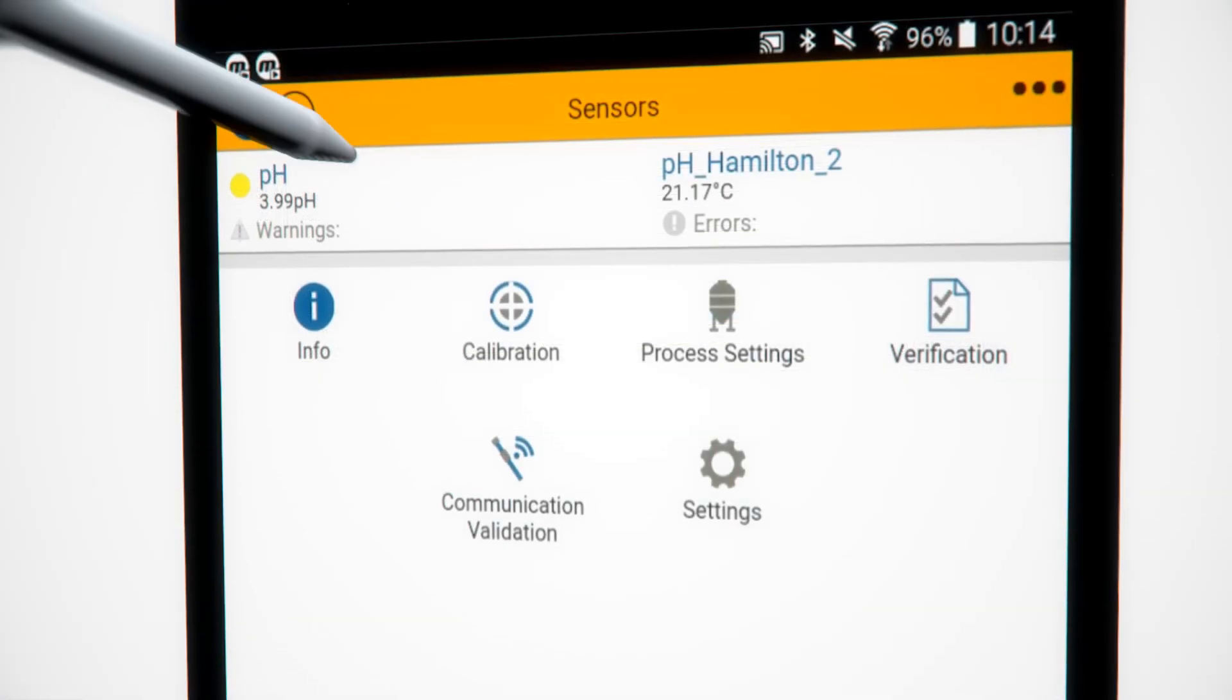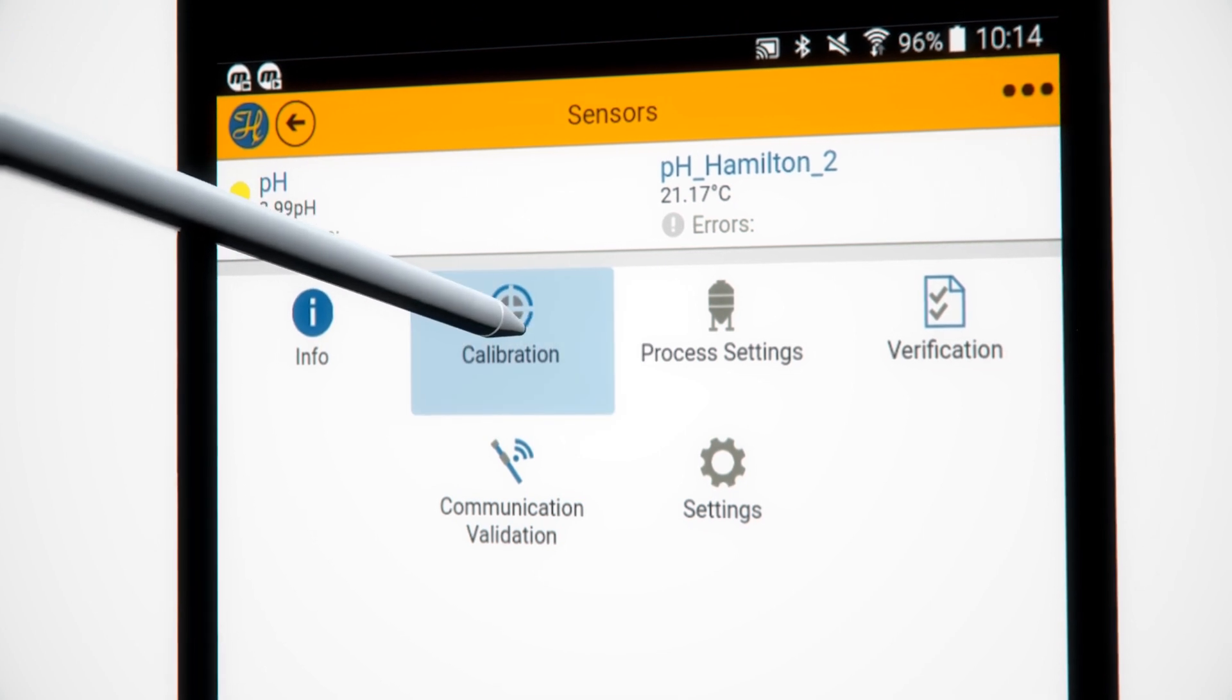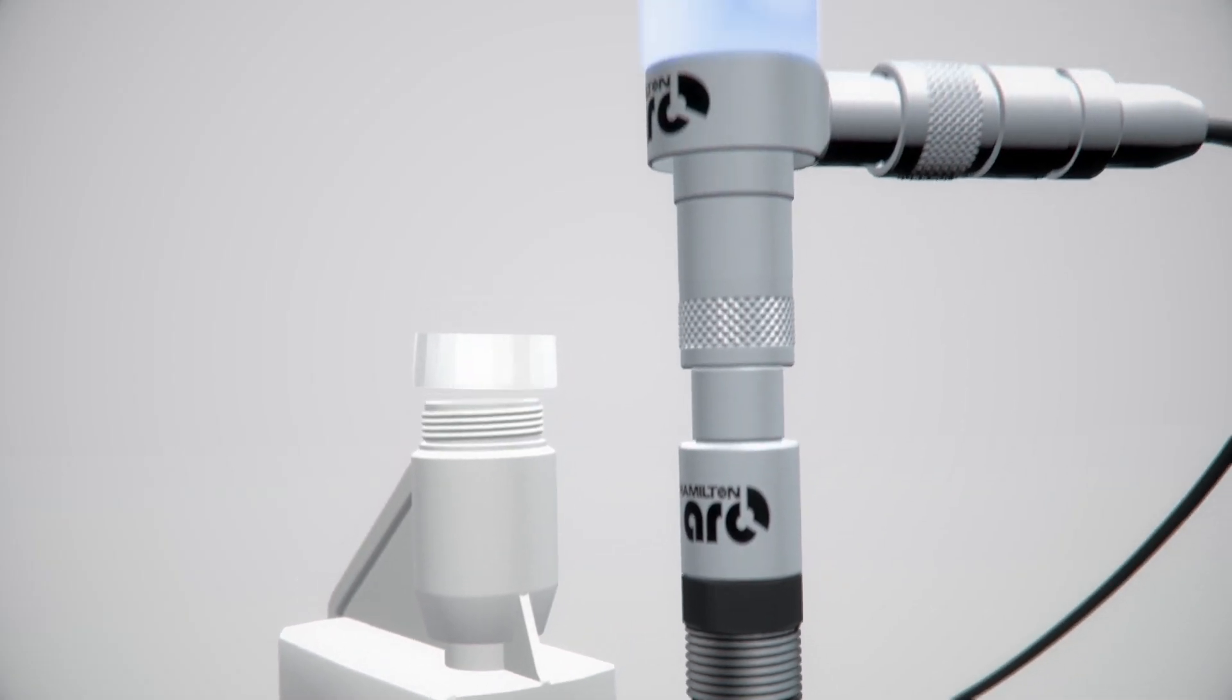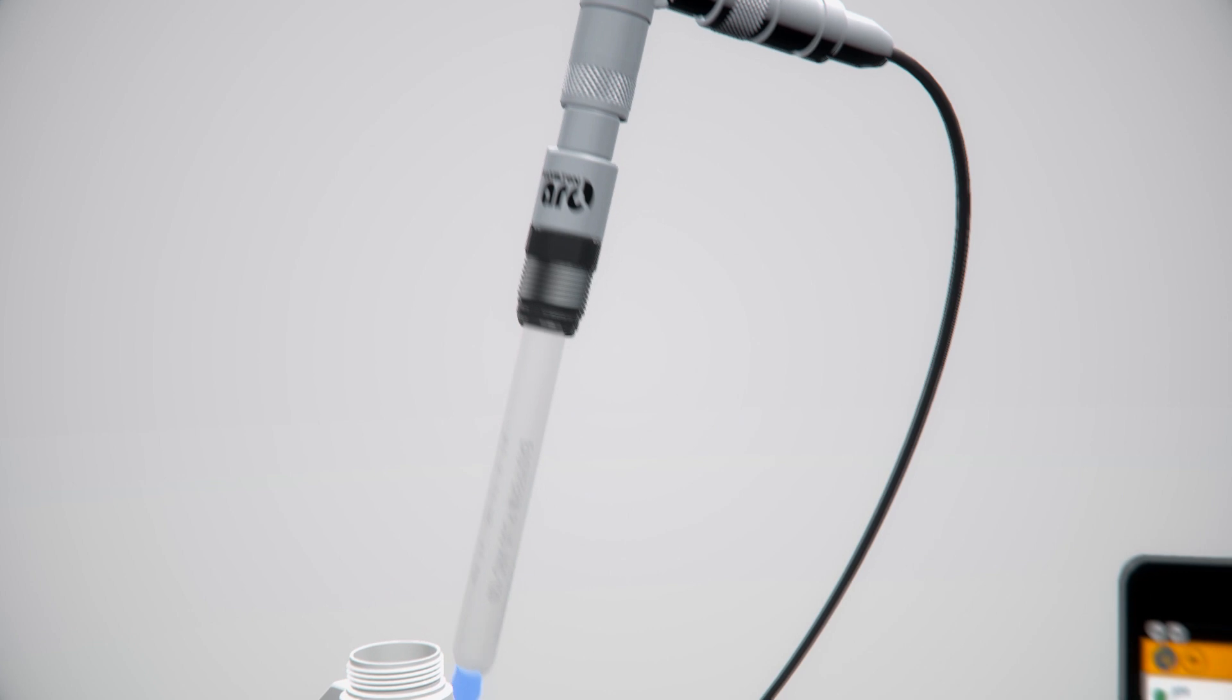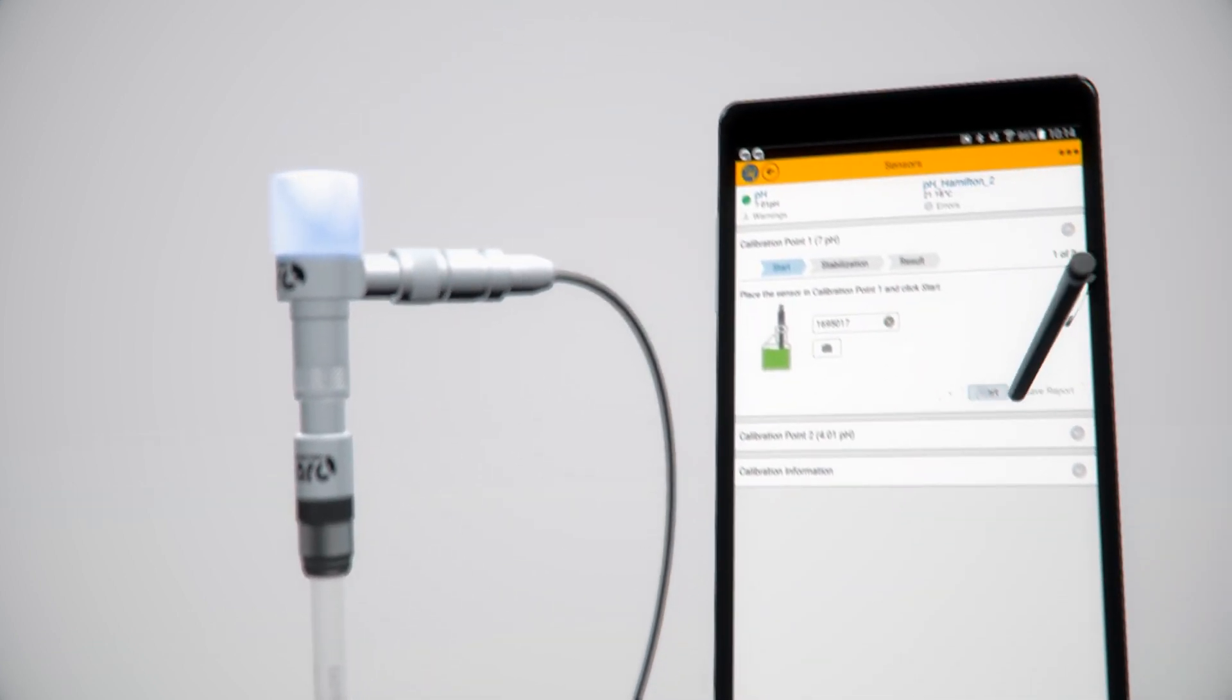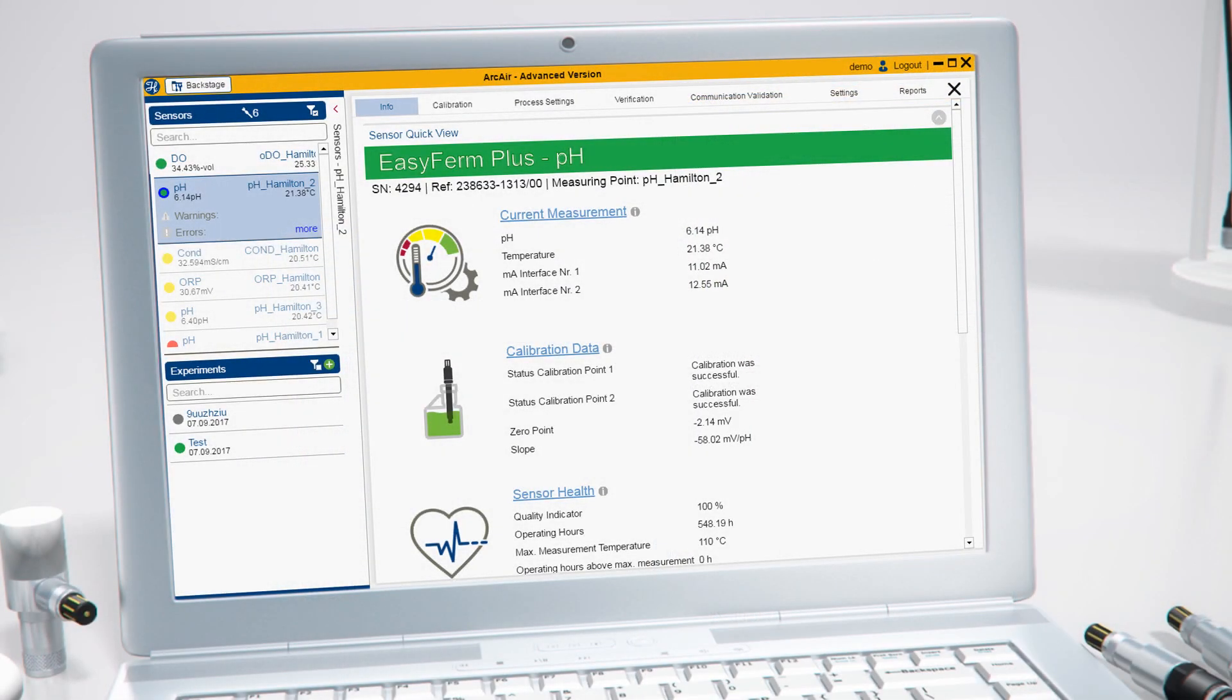Now it's time to calibrate the sensors in your environment. ArcAir guides simple calibration in the lab or at the line while automatically documenting sensor status and maintenance tasks.